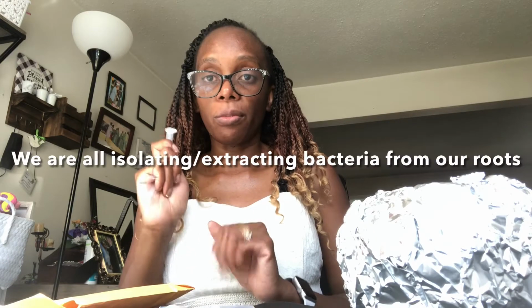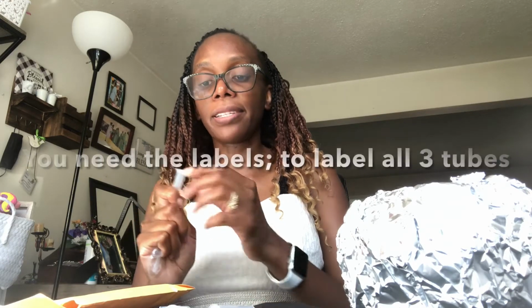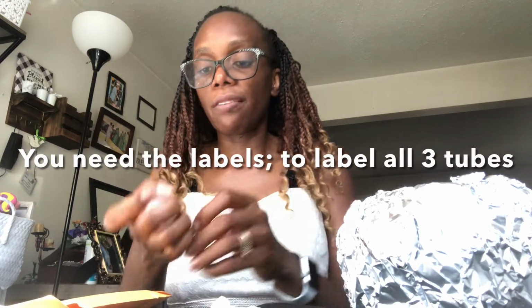So it's possible that if you don't have any nodules, maybe it's that initial stage, where the communication has happened, there are some bacteria in there, but they haven't formed nodules. Or there could be other kinds of bacteria in your roots that don't induce root nodules. So we are all isolating bacteria from our roots. All right. Okay, so have those three.